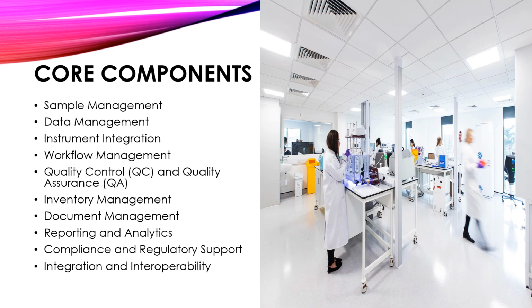Laboratory management systems consist of the following core components: sample management, data management, instrument integration, workflow management, quality control and quality assurance, inventory management, document management, reporting and analytics, compliance and regulatory support, integration and interoperability. Now, sample management.